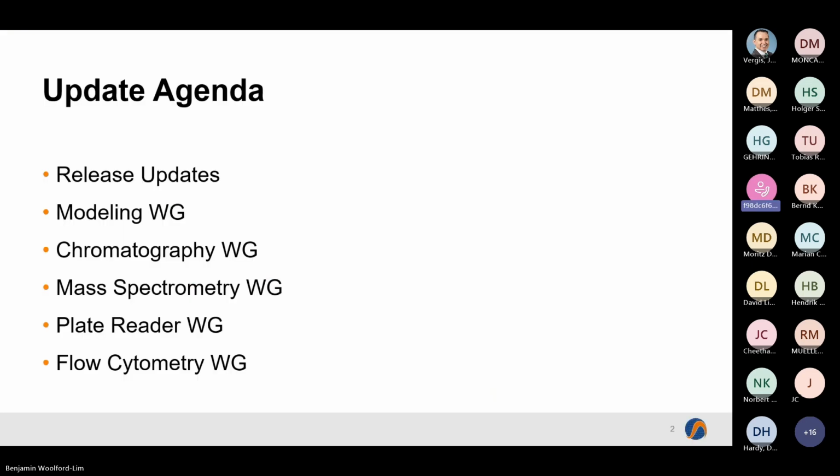Okay, so as stated, we'll just quickly go through updates from the two releases since the last meeting. Then updates from all of our active working groups: the modeling, chromatography, mass spec, plate reader, and flow cytometry.